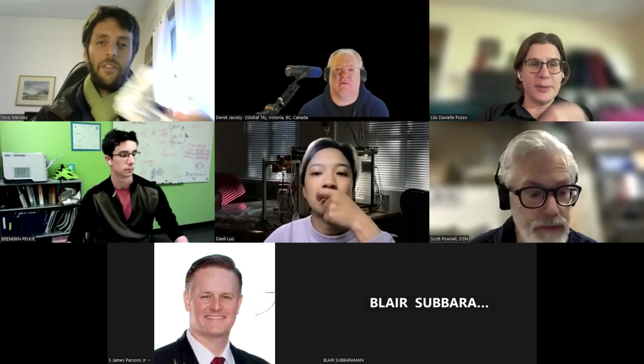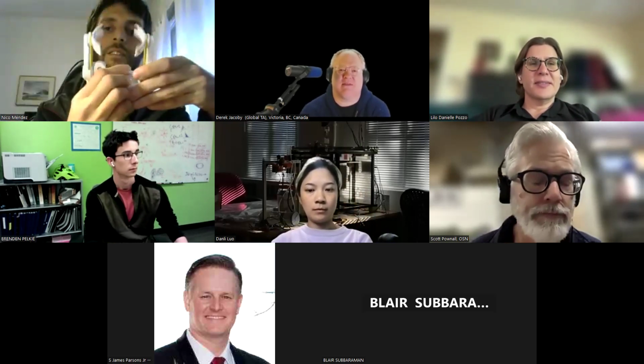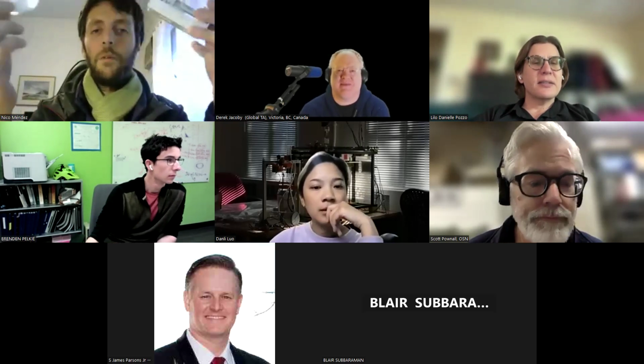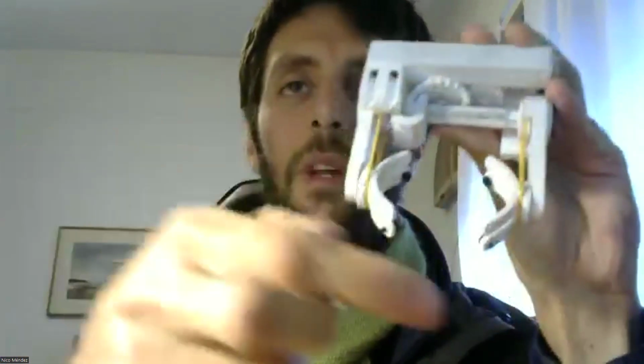Well, I found this Petri dish plate handler, which does these motions, and it can grab the small plates. And I work with yeasts, right? So it would be really nice to have this little machine to grab the plates and move them around and pick colonies and start cultures.